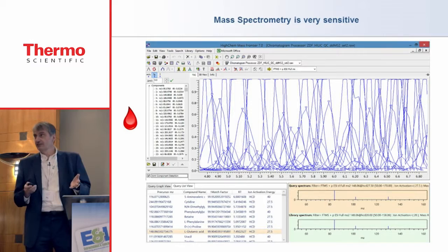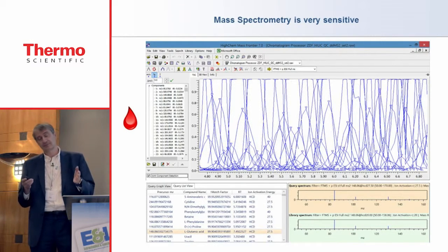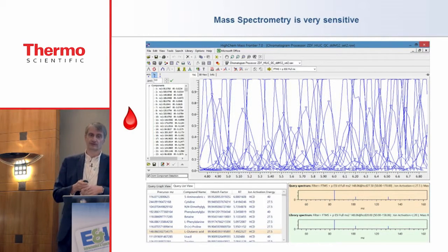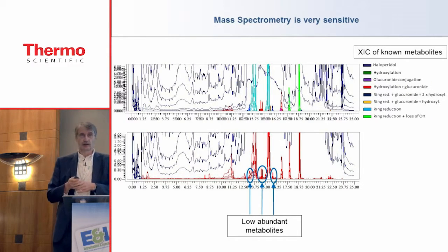Today we can identify maybe 10, maybe 15% of them. Some people claim 20%, but I would be rather skeptical. Still, this is a very small portion of all the compounds we can detect in complex samples. If we reduce the structural space and look only at some pharmaceuticals in human plasma, this is one metabolite experiment.